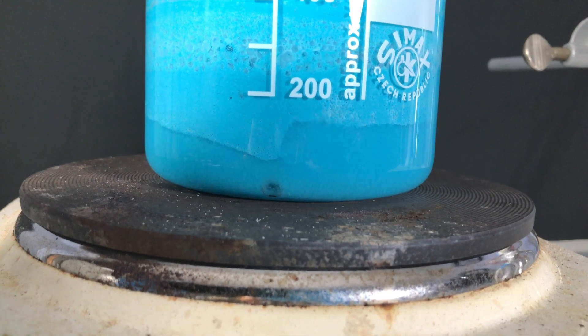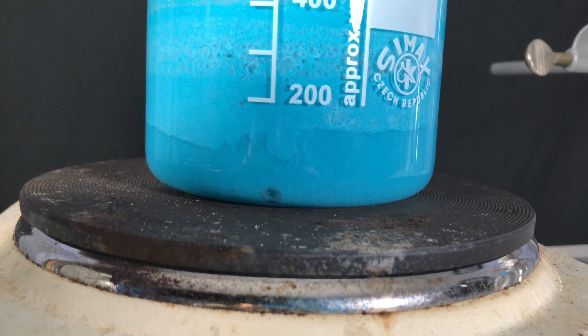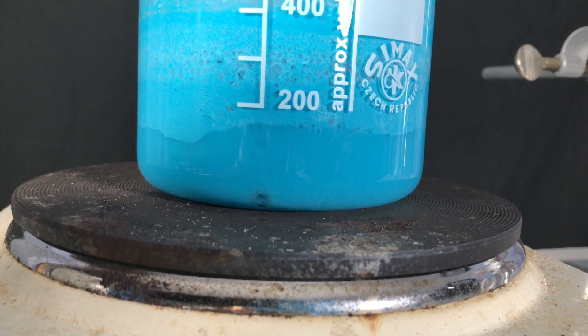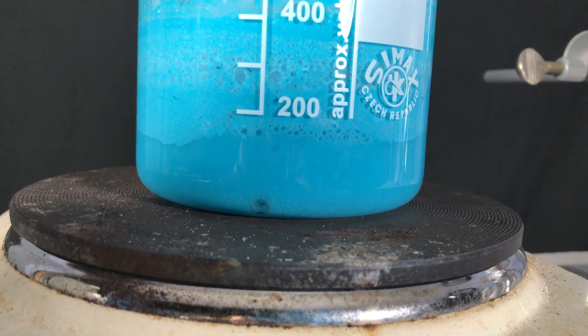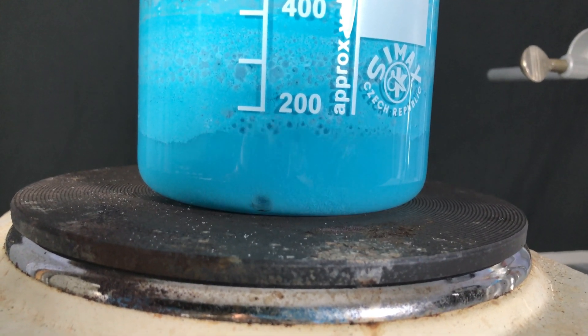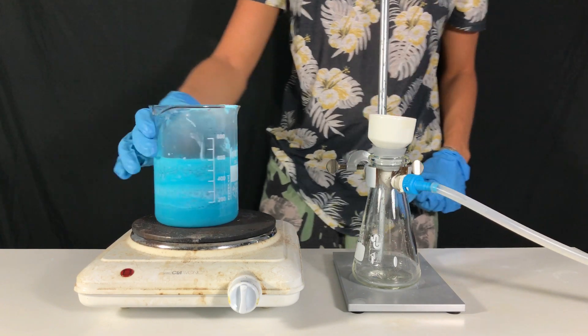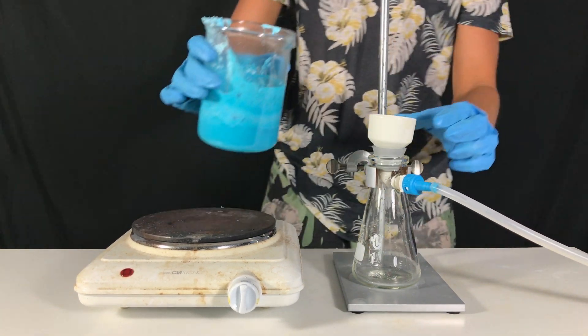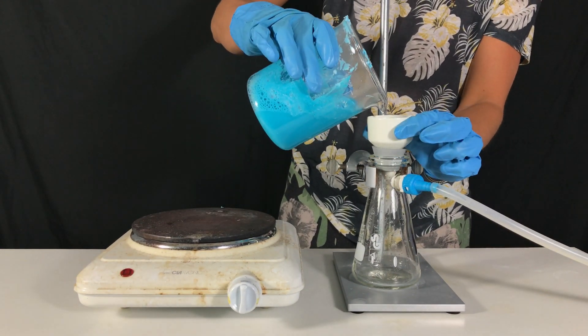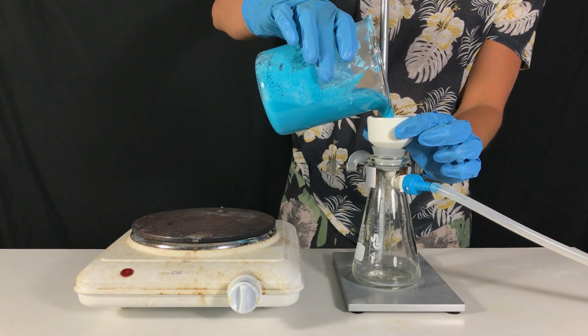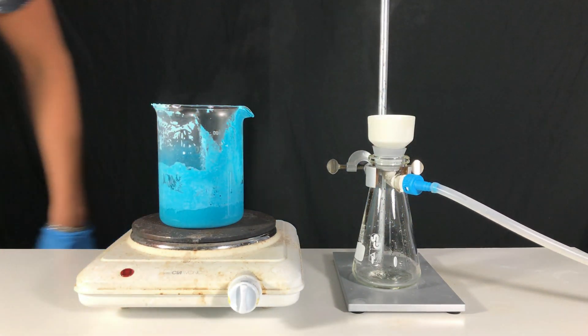The copper benzoate formed quite interesting patterns while being heated. A second vacuum filtration was performed while everything was still hot. Our goal here is to get rid of as much of the sodium sulfate that was formed in this reaction.